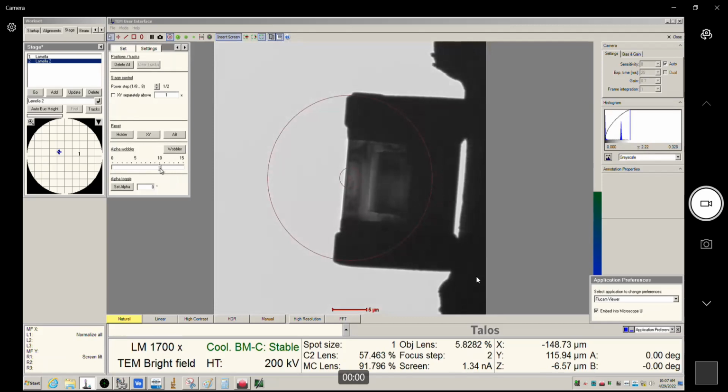So eccentric is only relative to the alpha tilt axis. It's not relative to the beta tilt. Right? So again, you're not doing anything with beta. You're just turning this on and then it's going back and forth, right? So you can see it's basically not moving. We're pretty close right here.